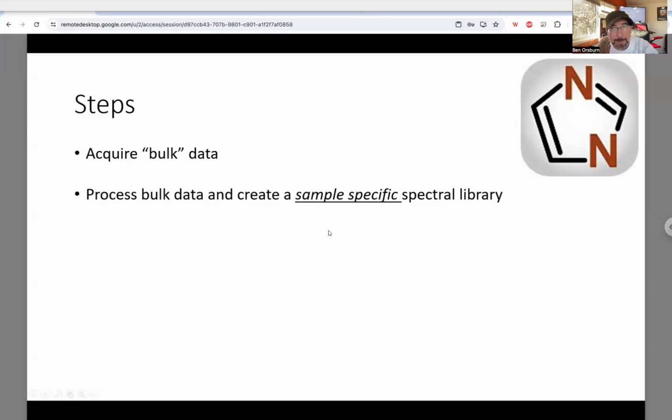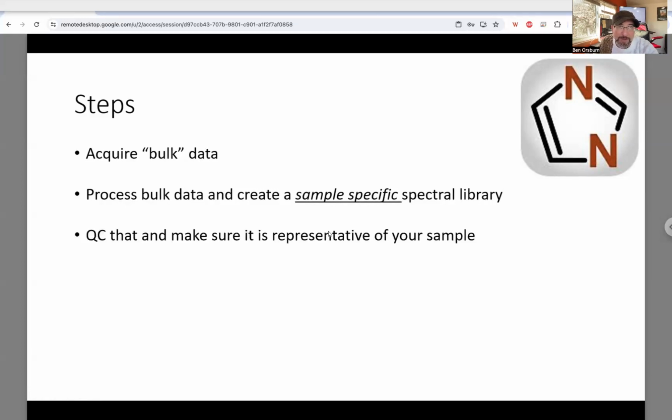I think with this example set that I'm going to show you, we don't really see that here with this DIANN analysis, but in the other videos, we'll see where this is.